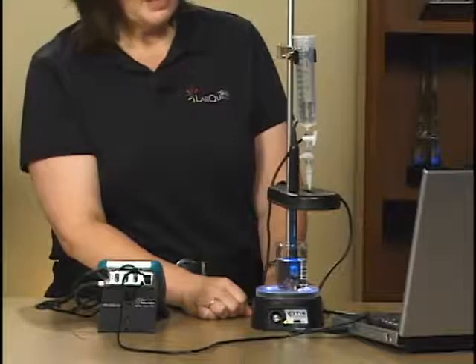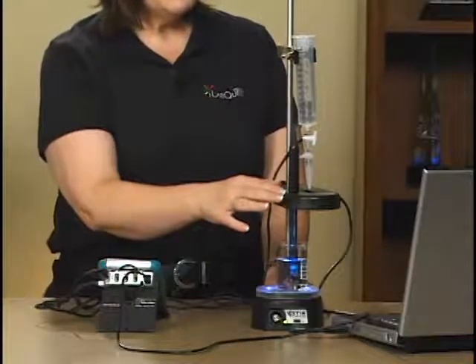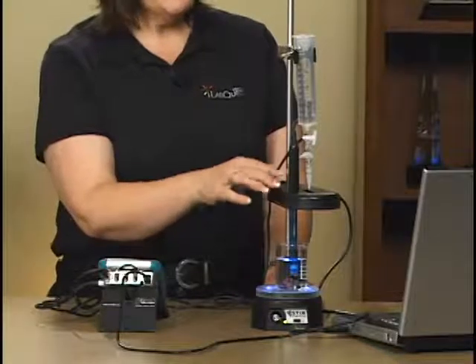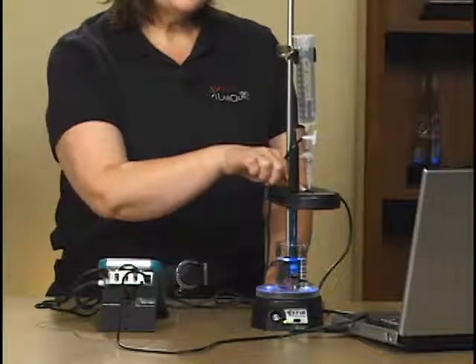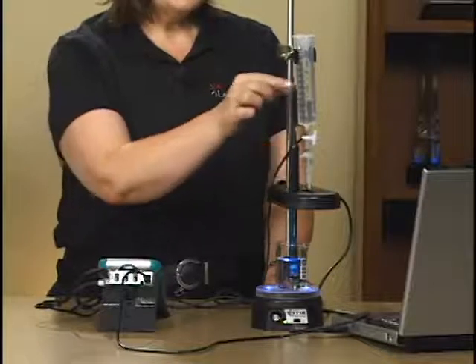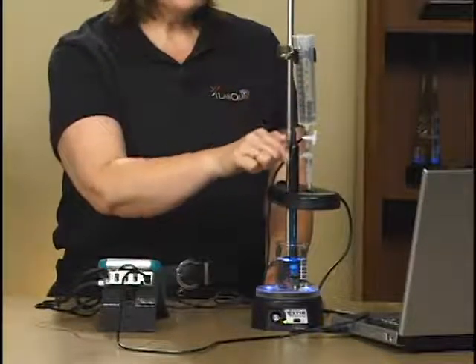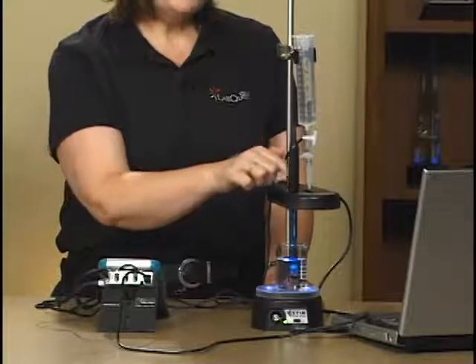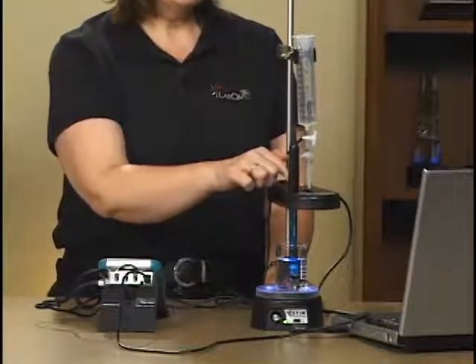The drop counter itself is made of two pieces. This part is the part that actually counts the drops. An infrared beam of light goes through this little slot on the top, and as the reagent reservoir drops through the slot, they will break the beam and count each drop. The software will then convert those drops into volume in milliliters.